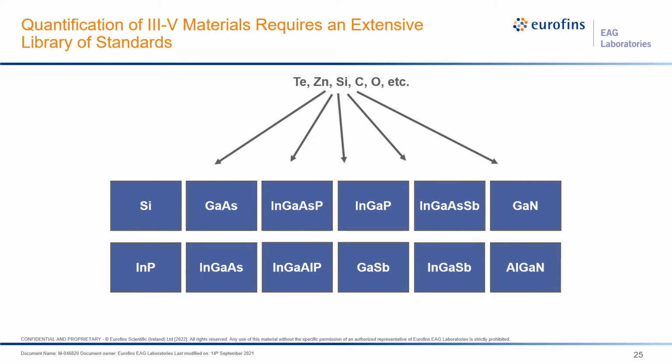For ionization calibration, we ion implant elements of interest into a variety of materials. We use some of the matrices to calibrate the ion dose that goes into these materials. We make an assumption that ion implantation into these different materials is exactly the same, and then study the ionization formation of these elements from one composition to the other composition, and develop a curve for calibration.